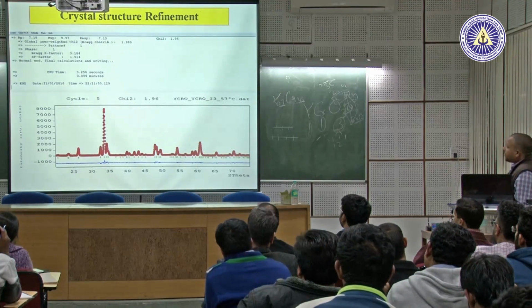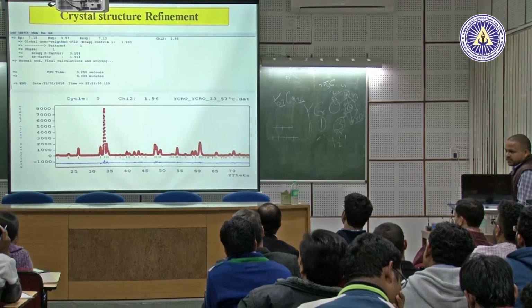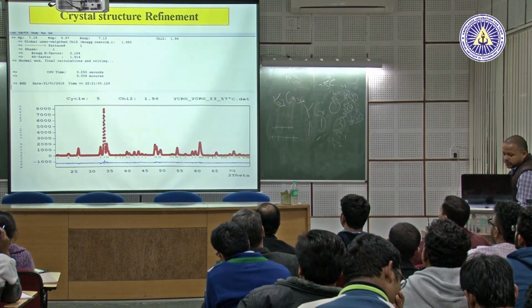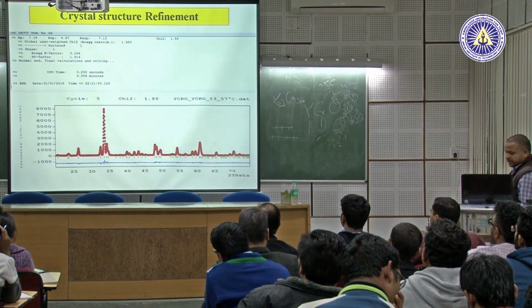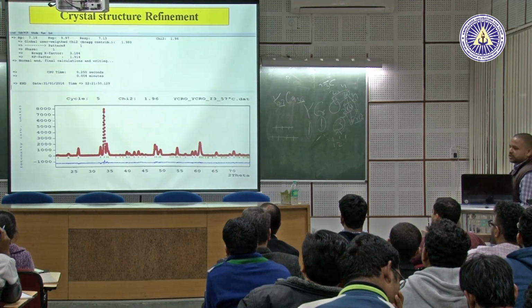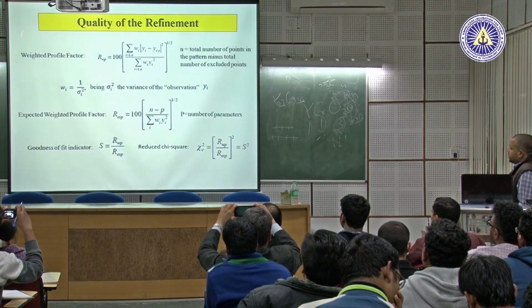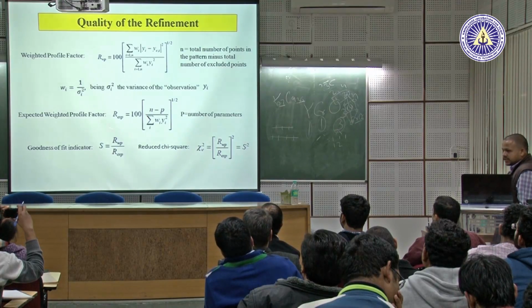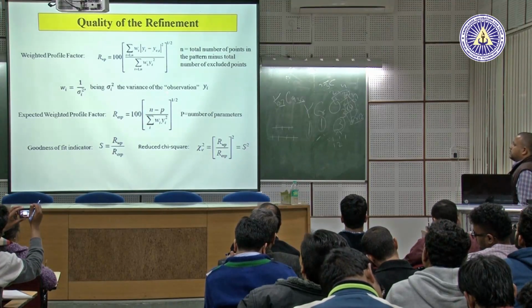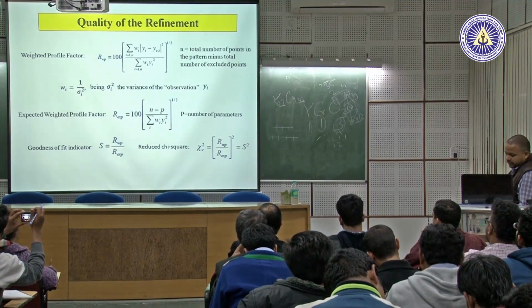Now you have all things, lattice parameters and atomic positions, in the correct way, the refined values of lattice parameters and atomic positions of your materials. Then you are ready to generate your structure. But before that, these are some mathematical equations, more correctly algebraic mathematics, and all equations are taken from the manual of the FullProf software, nothing hidden here.